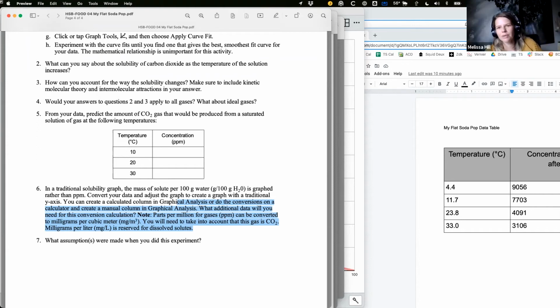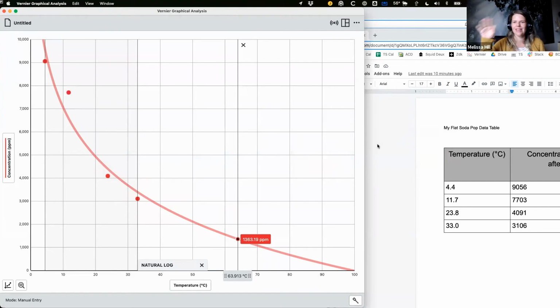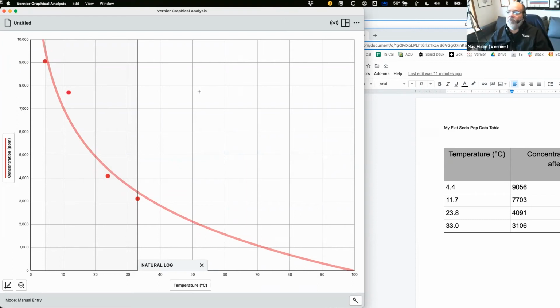No, that's that same bug we keep talking about: when you data share, the table labels are different for you than for those that you shared it to. The axis labels are updated, but the table isn't. And so that's just a software bug. And we hope if you do share it after you've collected all the data and changed all of it, it does pass correctly. But it doesn't do it live. So we're hoping they can get that fixed. But at least the data's there somewhere. It's just in the axis label and not in the table.